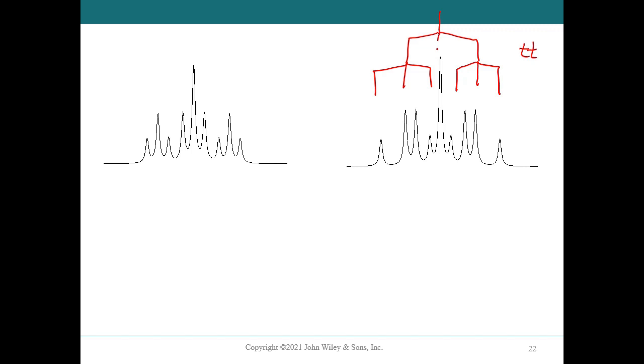And then the center one also being split to here. So we have one triplet here. We have another triplet there. And I think I can change pen colors. I'm going to do the center triplet in blue just to bring that out. But you can see each of these triplets are there.